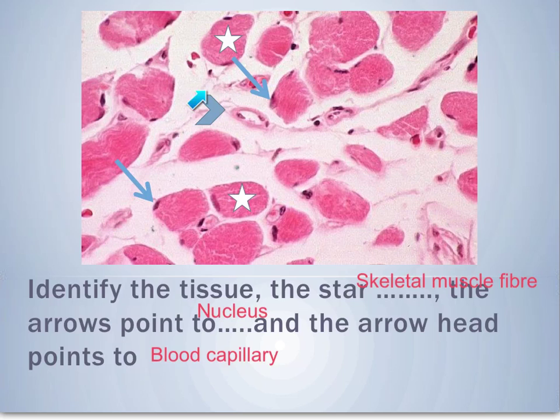And we have an arrowhead which points to the blood vessel having a lumen and formed of one layer of flat squamous cells, so it is a capillary. Another one here containing few RBCs, and another one here and another one there, so these are capillaries. Of course, the capillaries are present in the three layers, epimysium, perimysium, and endomysium, but their size decreases with entering to the inside of the bundle.